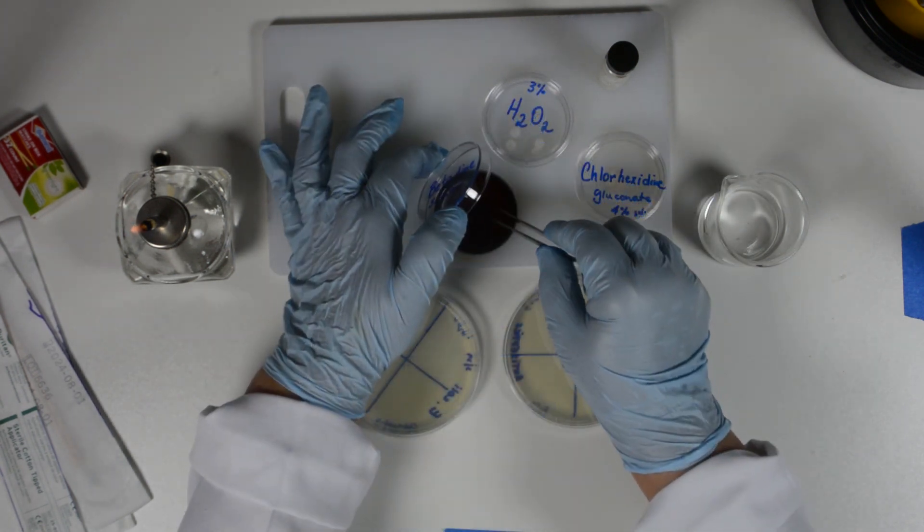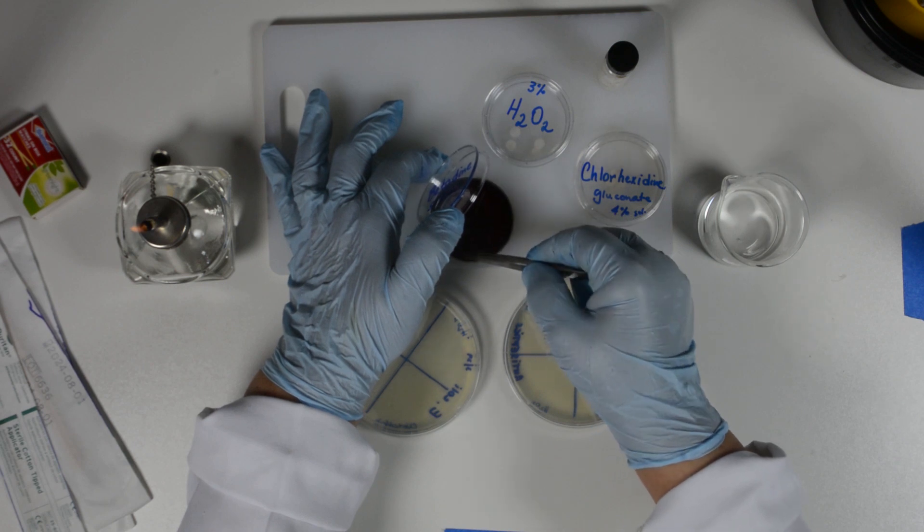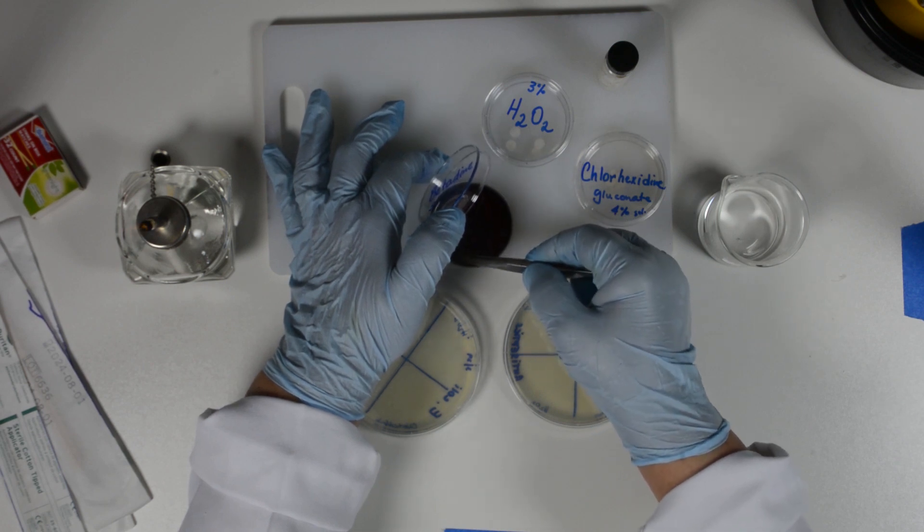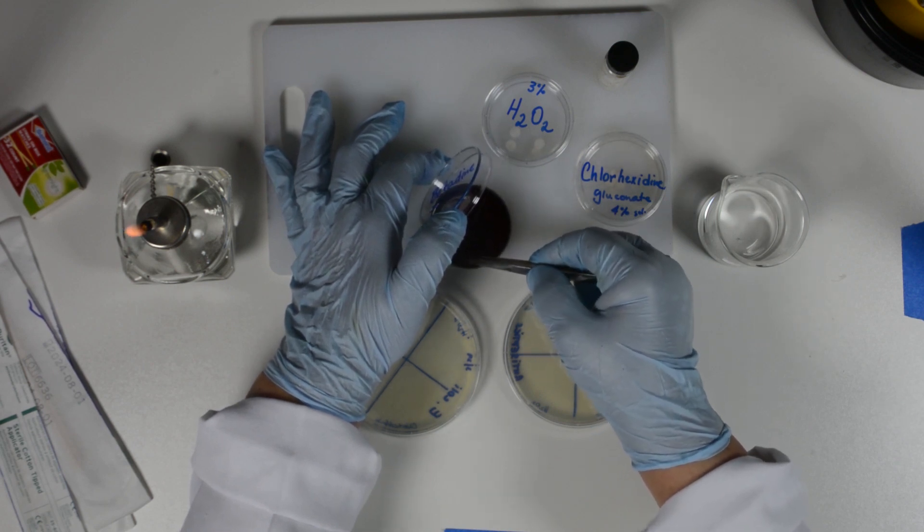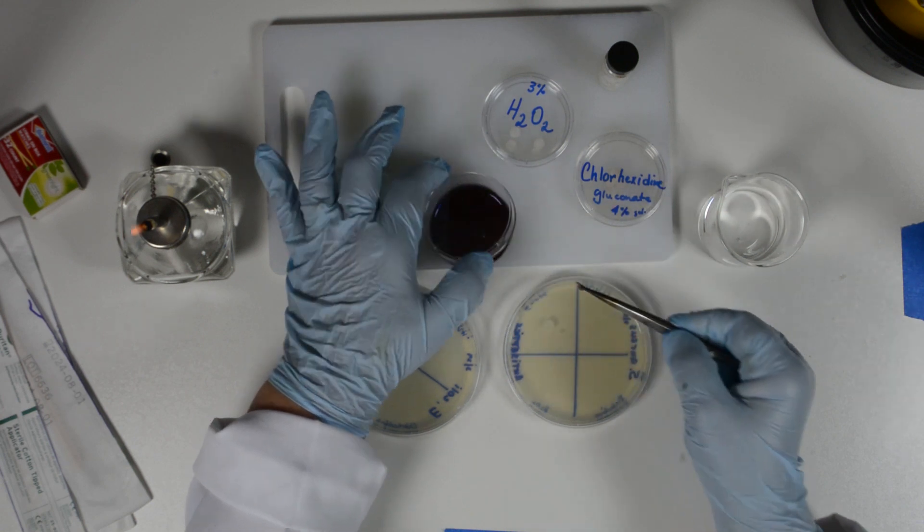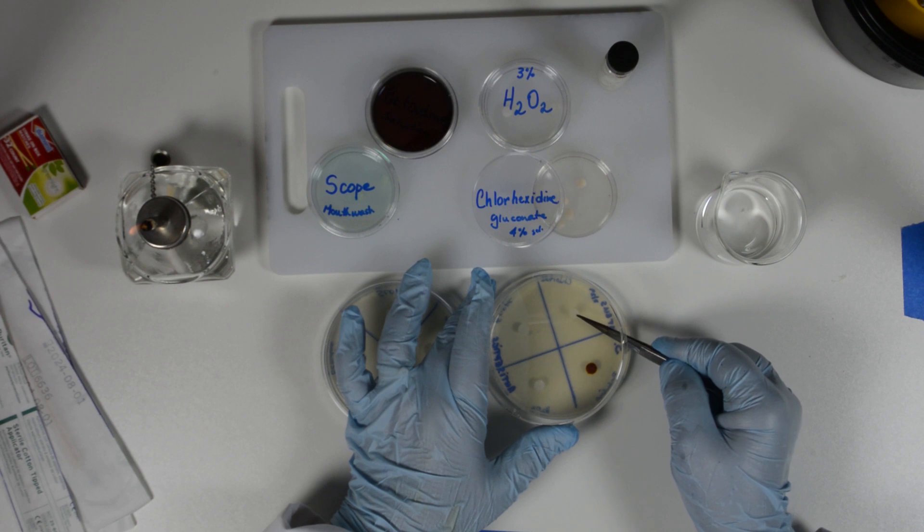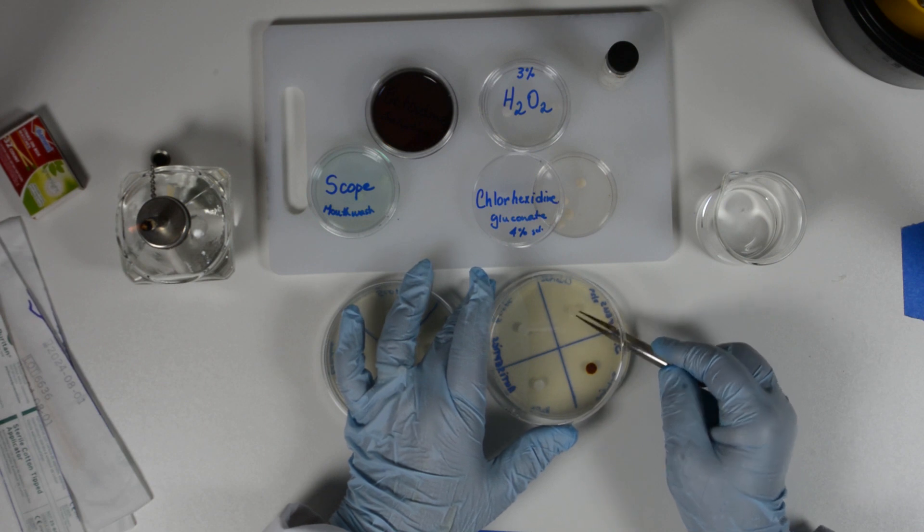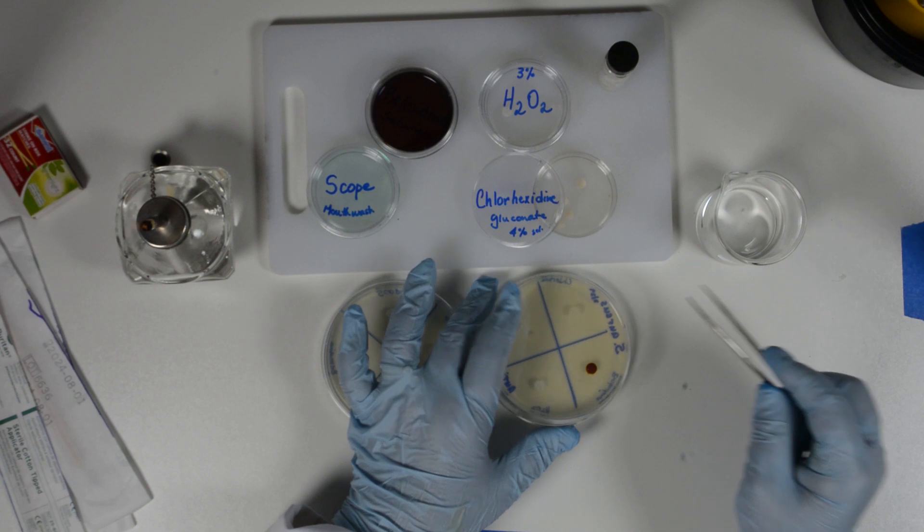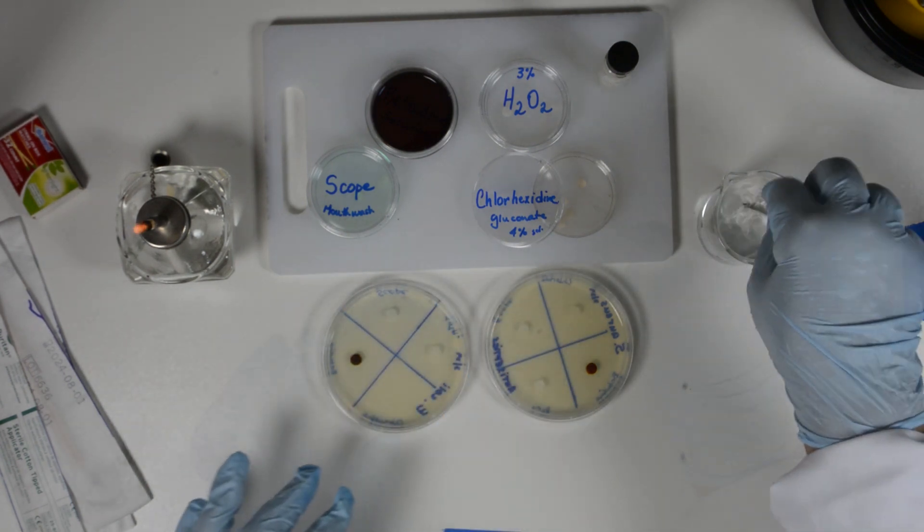One of the blank discs soaked with the chemical was picked up using the tweezers. The disc was then touched on the side of the plate to drain excess liquid. We open the plate with the prepared lawn, just enough for the tweezers to fit in, and gently place the impregnated disc in the middle of the already labeled quadrant.